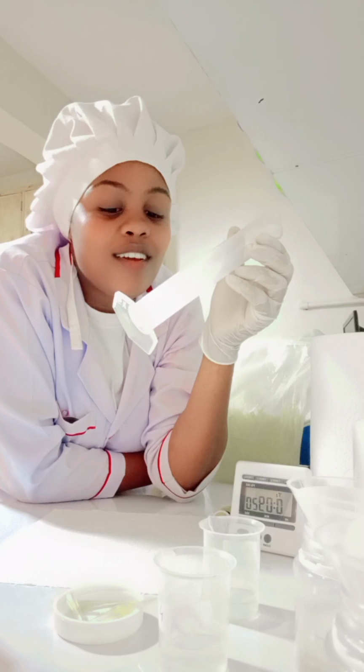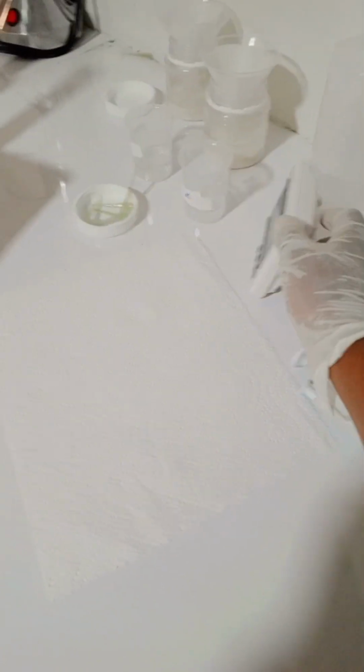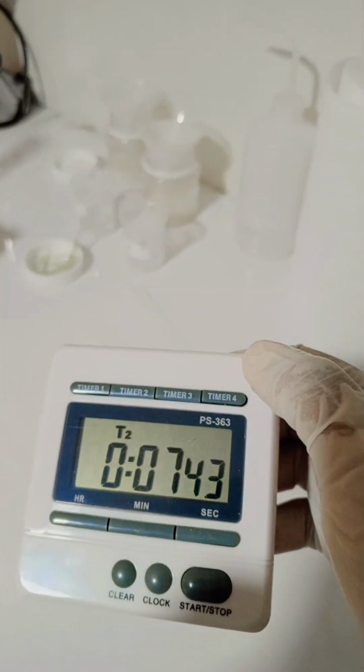It's directly self-explanatory, in a measure. Okay, now I think I was trying to see the time. Yeah, our incubation time was at 7 minutes, remaining 7 minutes and some seconds. Yeah, now at that point I was trying to put on the reader.